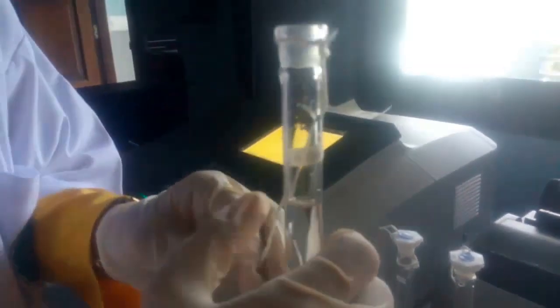And this is the 12 ppm standard of chloramphenicol. Wash off the cuvette with 12 ppm standard of chloramphenicol. Then fill up the cuvette with 12 ppm standard of chloramphenicol. Wipe the cuvette with tissue.